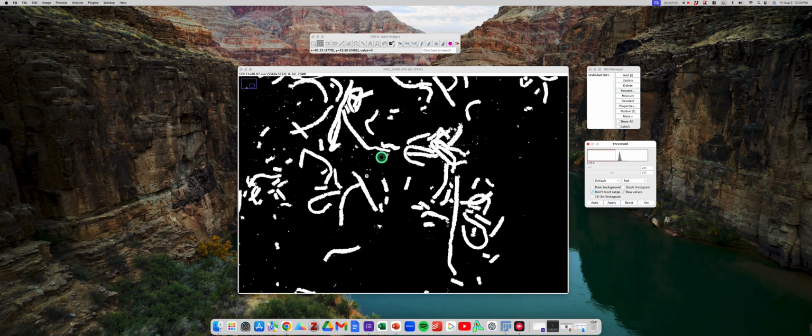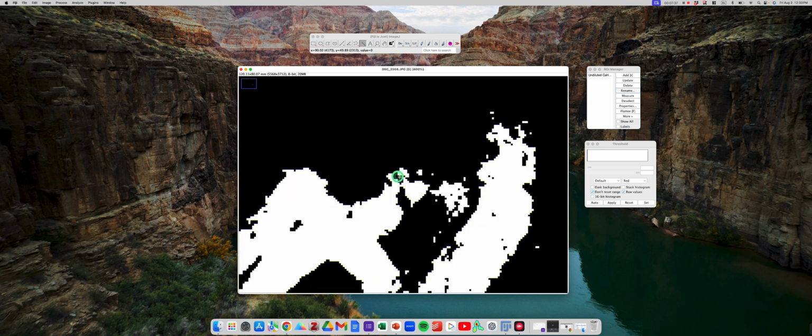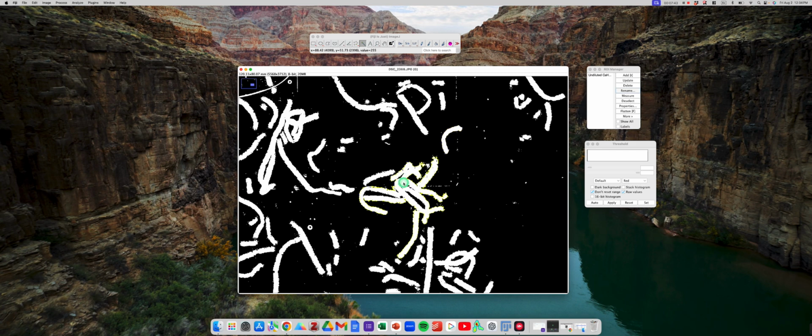Now, one thing you'll note if we zoom in here is that these are individual segments, but if we were to try to measure them, and I'll show you how to measure an individual, you can click this magic wand tool and double click it and increase the tolerance to 40 and click OK. And then if you click on something, it will highlight it in yellow. You can see that this is outlined in yellow here. And if we were to measure this, then you can see this highlights the entire blob. And so we need to create separations between these chunks.